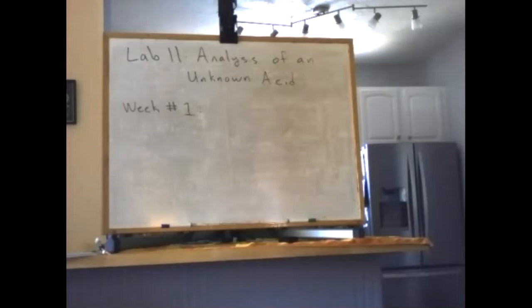Good afternoon, everybody. We're going to talk about the first week of our analysis of an unknown acid lab. We'll be starting this lab this week and finishing up next week. It's a two-part lab, so again, please just send me one comprehensive lab report from the 2 weeks of this particular lab experiment. All right, what we're going to study in these 2 weeks are acid-base reactions.